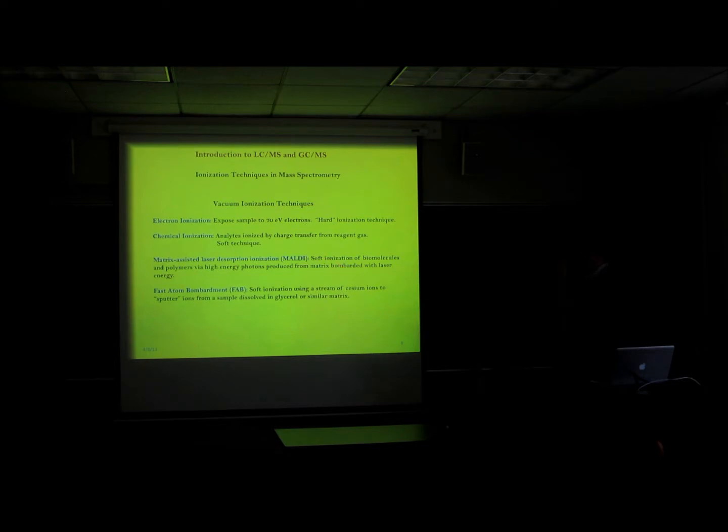A very soft ionization technique forms primarily singly protonated ions, and very powerful for intact proteins, polymer analysis, things like that, where you just need a quick and dirty analysis. You can spot 120 samples on a stainless steel plate. It takes you a few seconds to get some mass spectra for each one of those places. So you aren't doing any separation here. Things need to be reasonably pure, that you can do some rapid mass spec for verification purposes on synthetic or biopolymers.